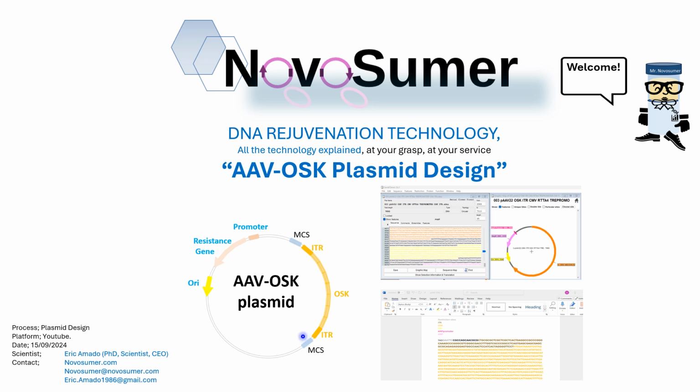This information carries the necessary instructions to amplify these genes in mammalian cells and to express these genes in human cells or another kind of cells. What we're going to do is understand each of the parts.